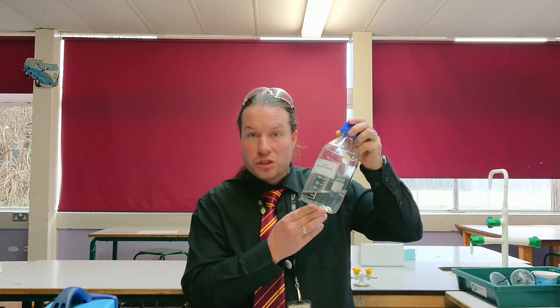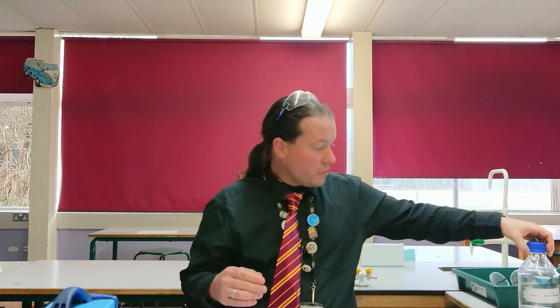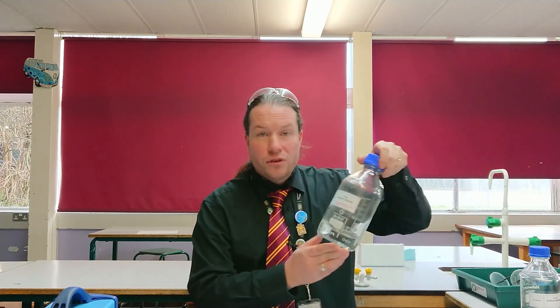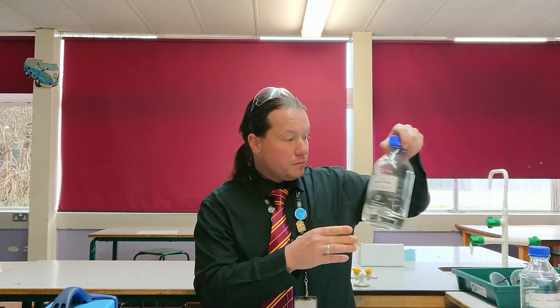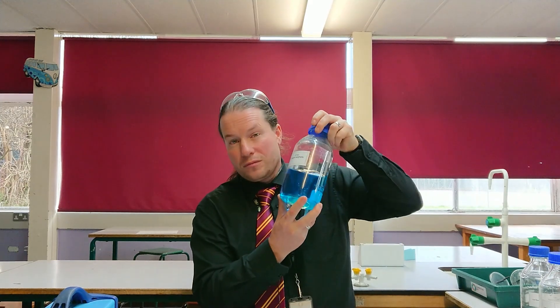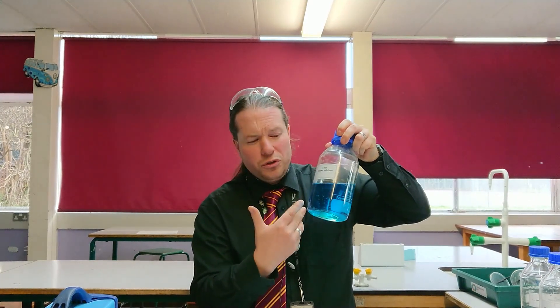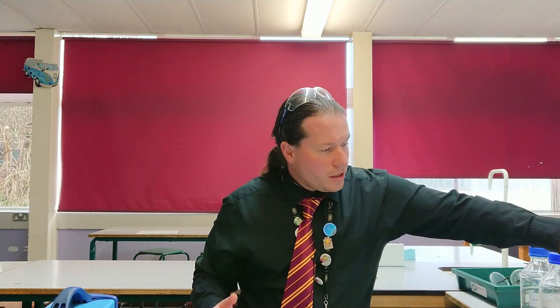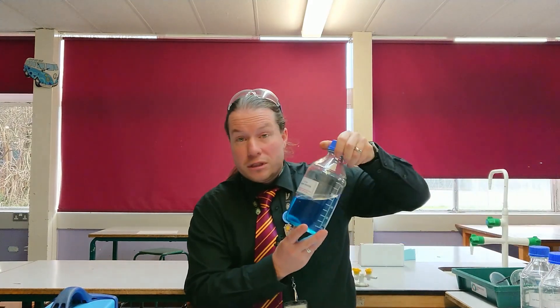First up, we've got sodium sulfate, then sodium chloride, copper sulfate - I love the color of this one, beautiful color - and copper chloride, which you will notice is the same color.